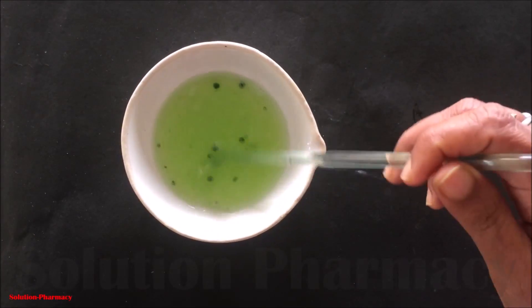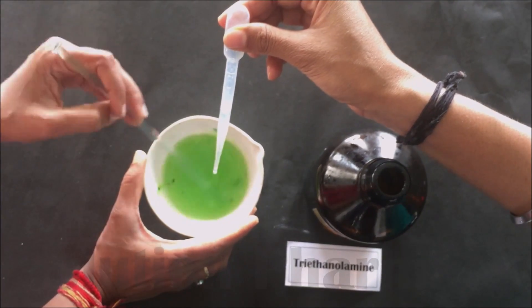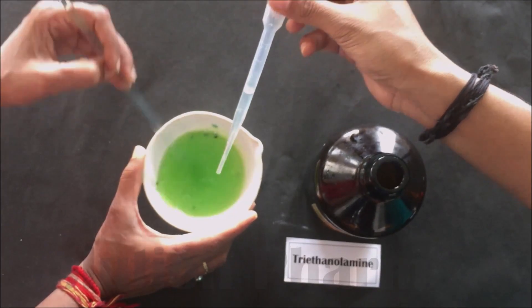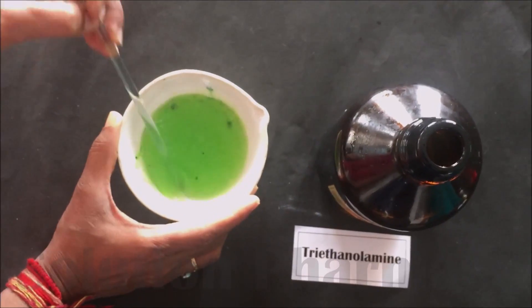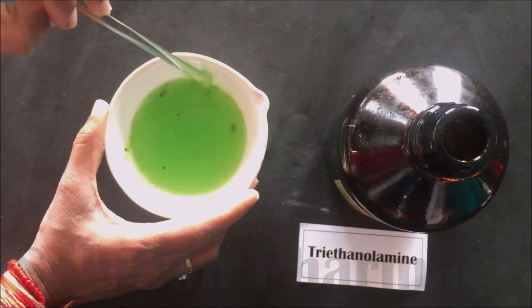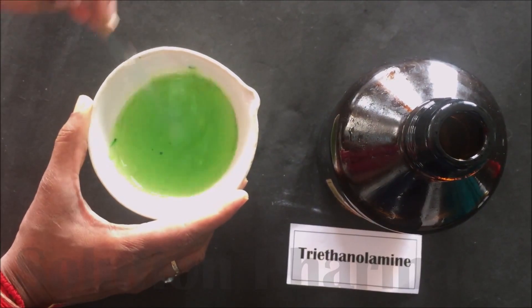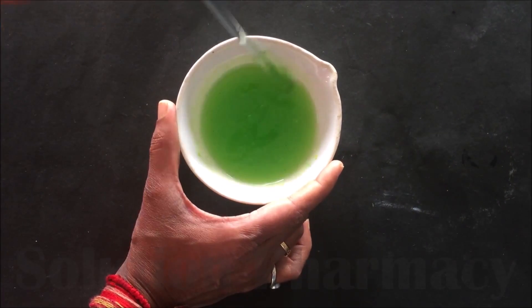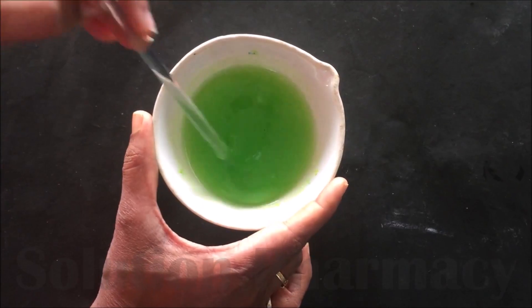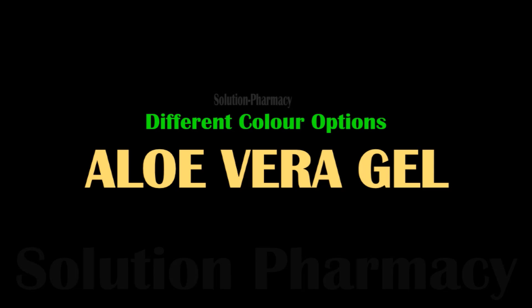You can see that the oil-like droplets floating on the surface are due to the Vitamin E; they will get mixed at the time of gel preparation. Then add 7 to 8 drops of triethanolamine — in short, TEA. Triethanolamine is a neutralizing agent that converts Carbopol into gel form; Carbopol is a gelling agent. During the addition of triethanolamine, continuously stir with a glass rod. You can see that the liquid slowly converts into gel, and after a few minutes all liquid converts into gel. Our aloe gel is ready.